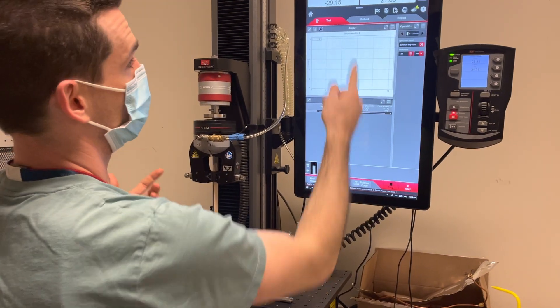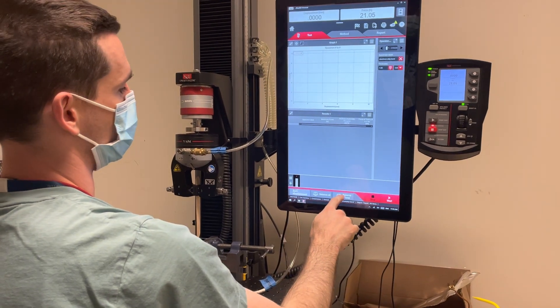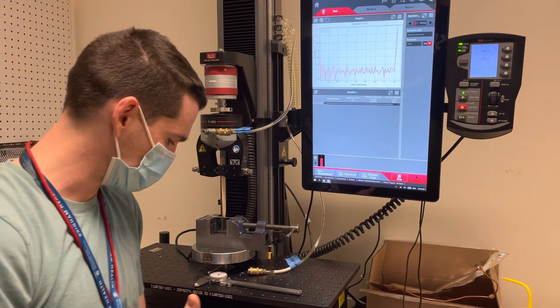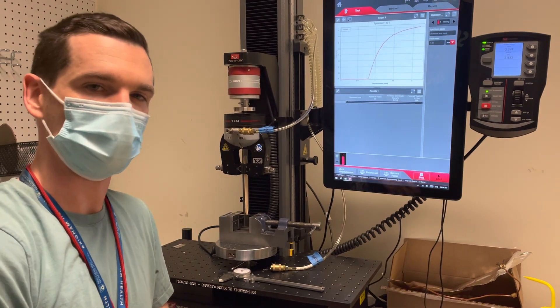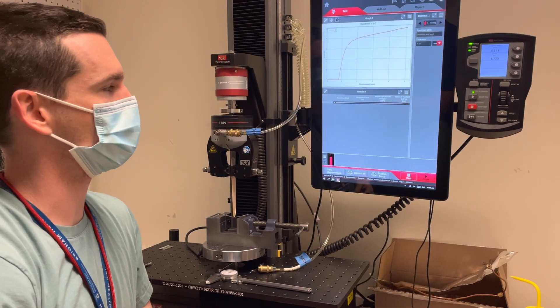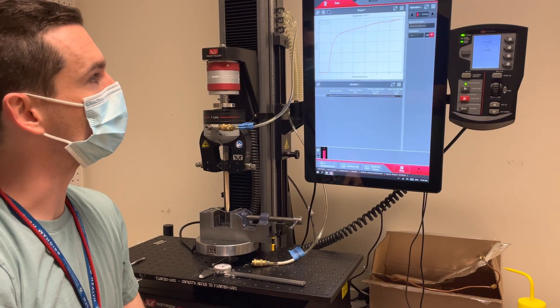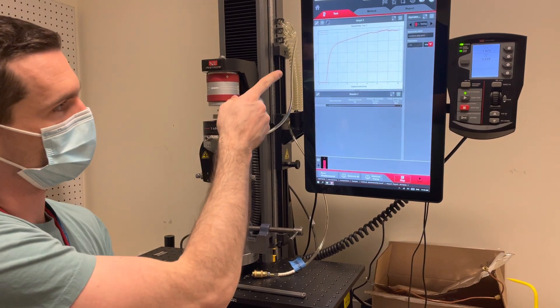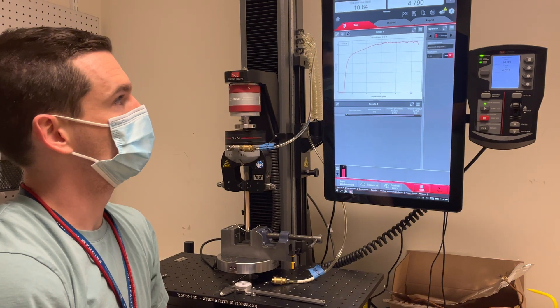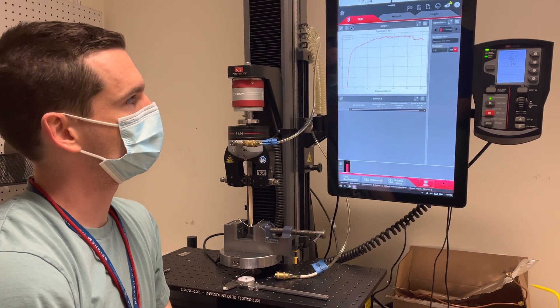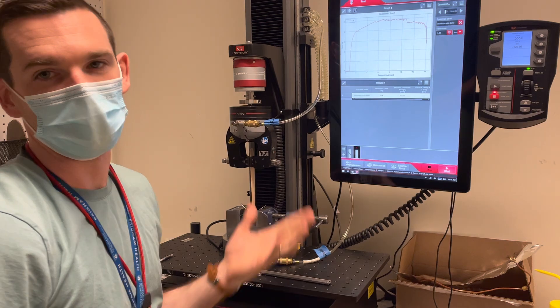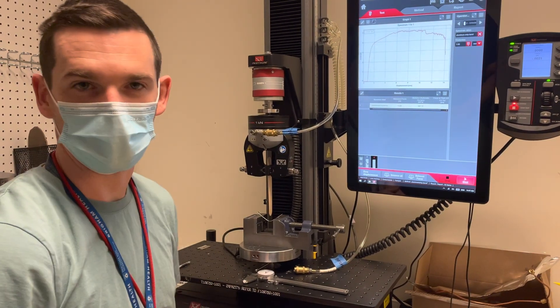If you actually ran this test, you'd balance your displacement, balance your load — it's going to move at 25 millimeters per minute — then hit start. If you have important samples, start with a non-important dummy sample first just to test your method. You can see it's moving and data is plotting, which is good. This should take about a minute, or if the force drops 50%, the test would also stop. At the end, it goes back to its original position. And that's how you set up your test method and check it with a simple test.